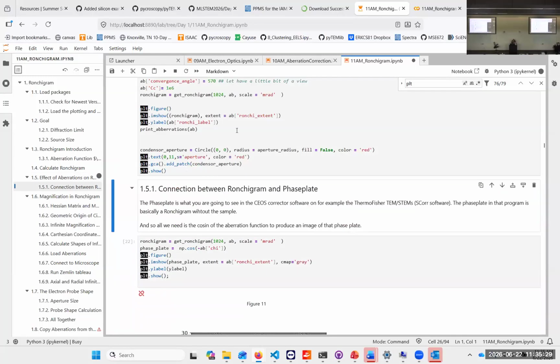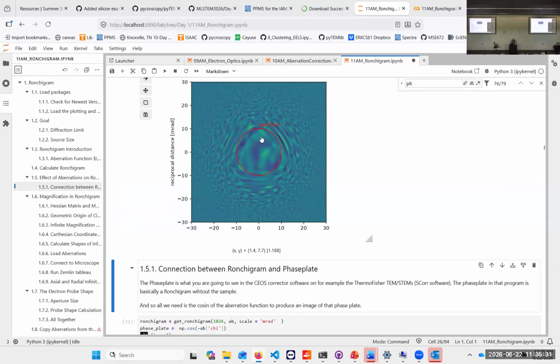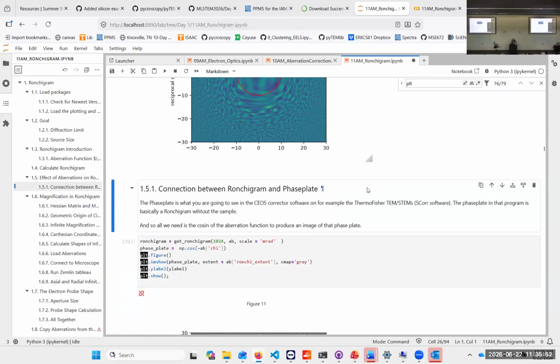Anyway, so one can play around with it and double check. Yeah, now we have our nicely triangular part here. So that is a threefold astigmatism. Instead of having it just like an egg, you now have this triangular distortion. Can everybody see that here? Right? So we have this triangular distortion.